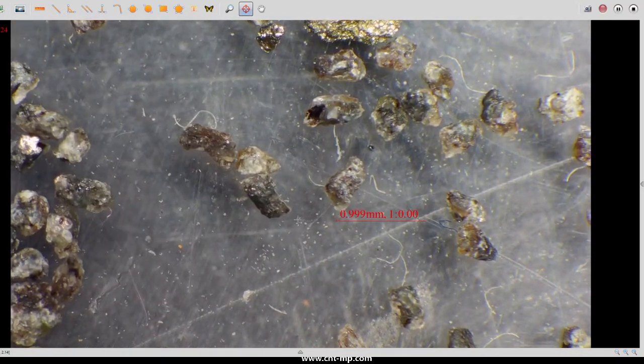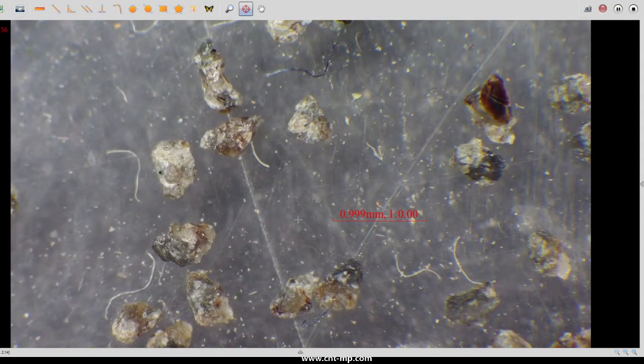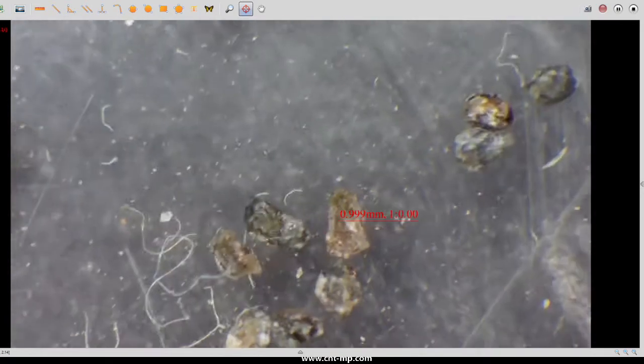No, it's not better. Sorry. It is really hard to show you how to do hand picking, so I would like to continue on the microscope.